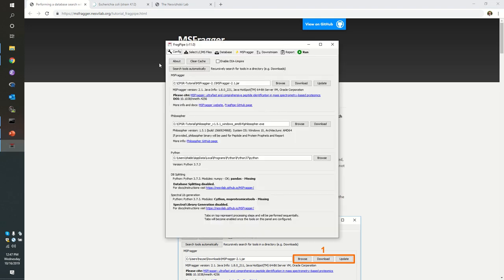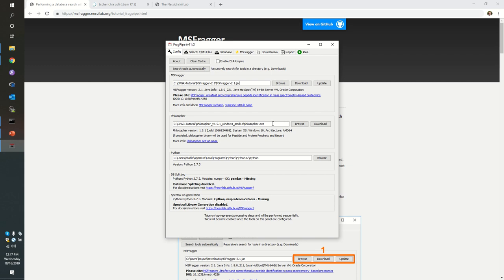Let us now return to our FragPipe interface. As you remember on this very first page, FragPipe has found where to find the MS Fragger jar file, where to find the philosopher exe that's designed for this platform, and of course it checks for Python.